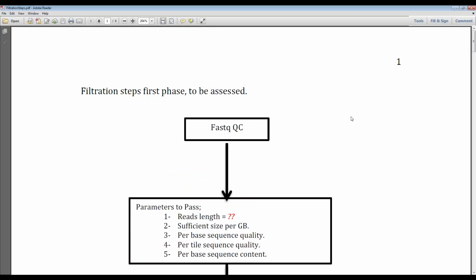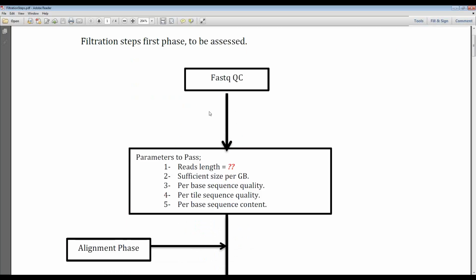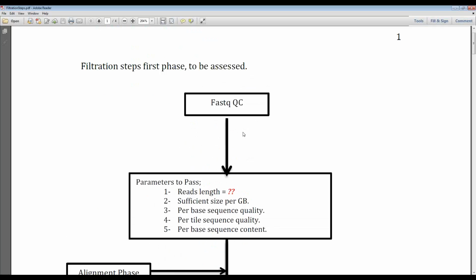So just to be clear, we don't do sequencing until now. Soon, hopefully in 6 months, we just received the equipment. But we do the analysis and interpretation, and also we have our own pipeline. So that's just a walkthrough of our workflow steps.